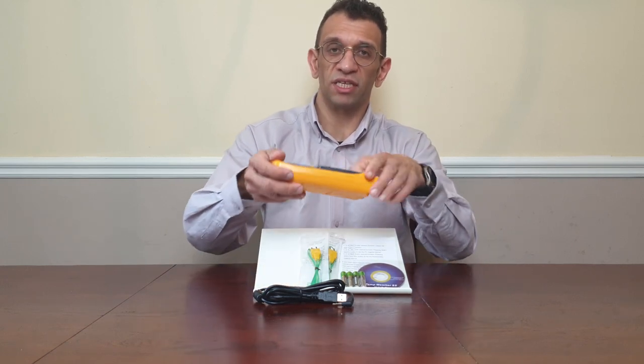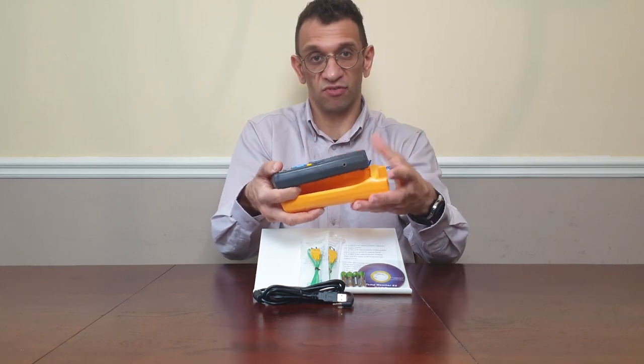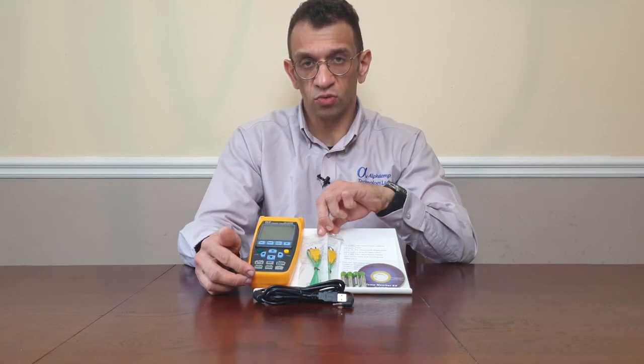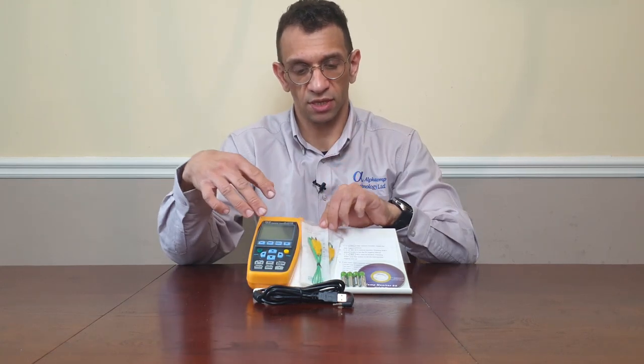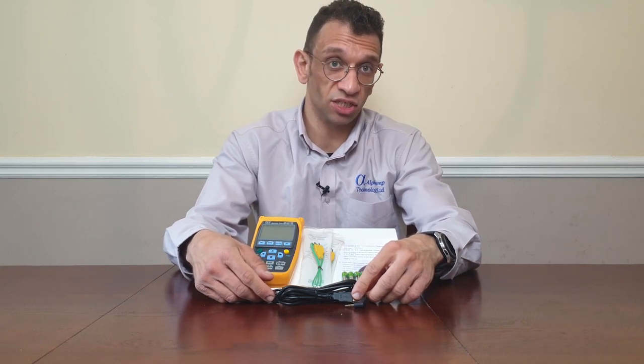So what comes supplied with it? You get a rugged case to protect your data logger. You also get two exposed junction K-type thermocouples, batteries, software so you can download the data, a USB connection to connect to your PC, and instructions.